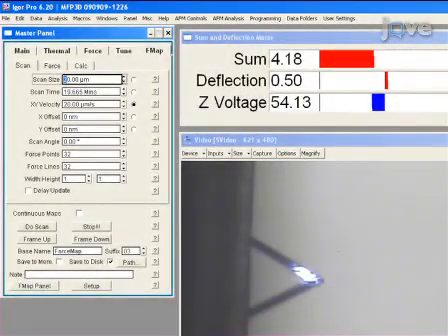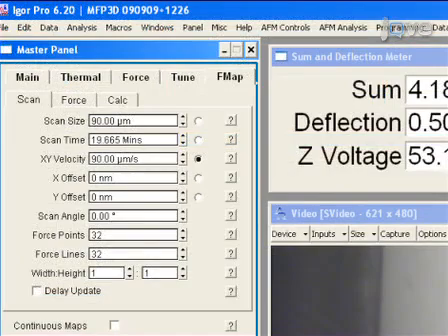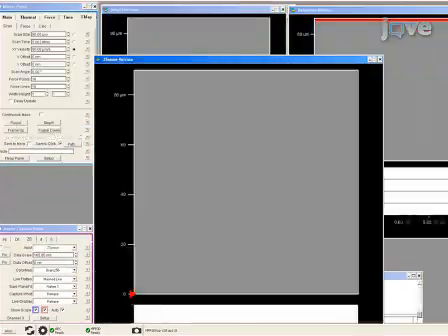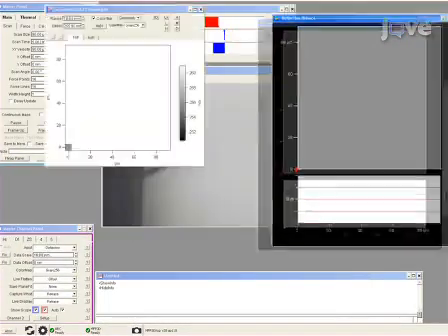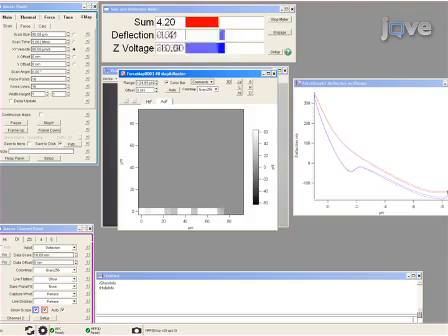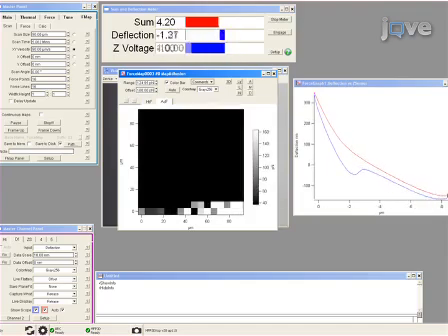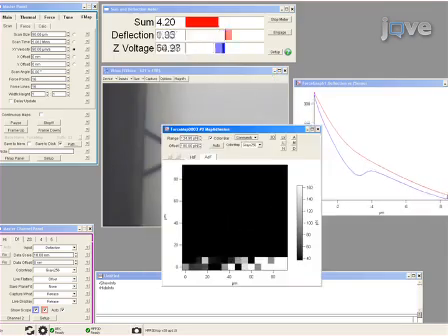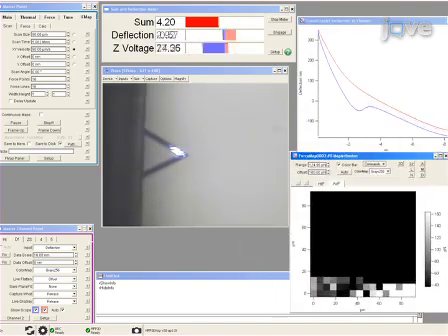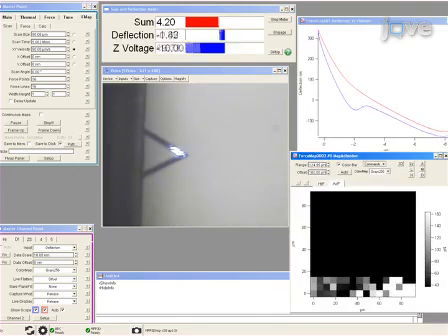For automated mapping of a region of interest, switch to force map mode. Select the scan size and sampling points within the selected area. The AFM tip rasters across the sample surface between indentation movements and collects individual force displacement curves at each point within a defined sample grid. We found it practical to use a 16 by 16 sample grid to map an 80 micrometer by 80 micrometer area at an indentation velocity of 20 micrometers per second, which can be completed in about 10 minutes.